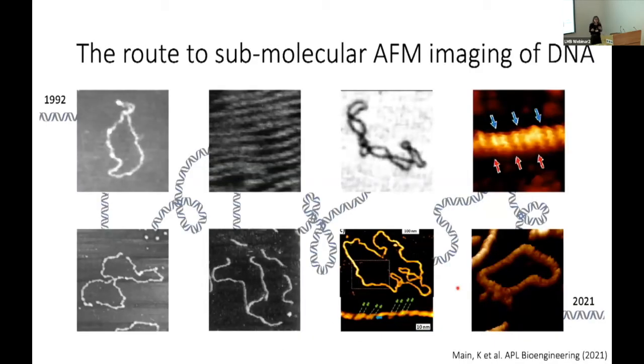And we're not the first people to do this. This started a long time before me. And I think when we're talking about next generation biophysics, it's also important to talk about what came first, right? So this is an image from Carlos Bustamante's lab where they first imaged DNA in air a long time ago. And actually people back as far as the mid-90s were able to image submolecular structure of DNA by closely packing it together on lipid bilayers and by stopping it being able to move around. So a bit more super glue to our blue tack.